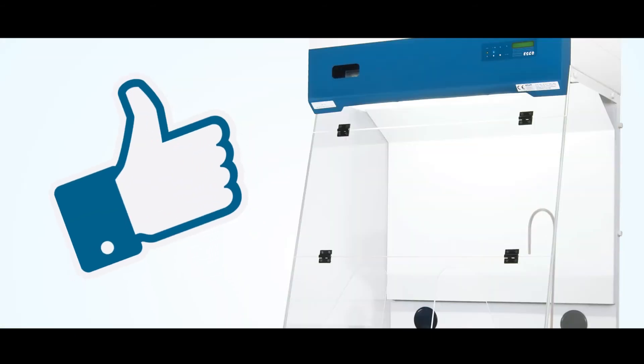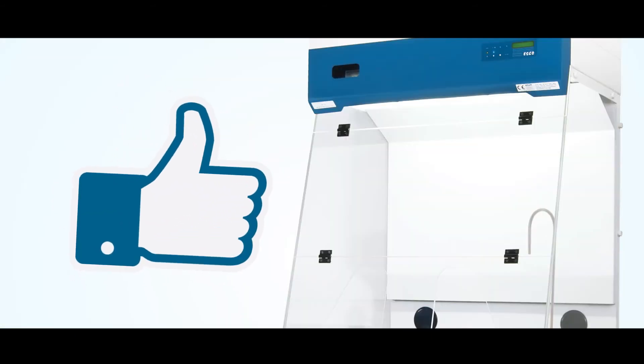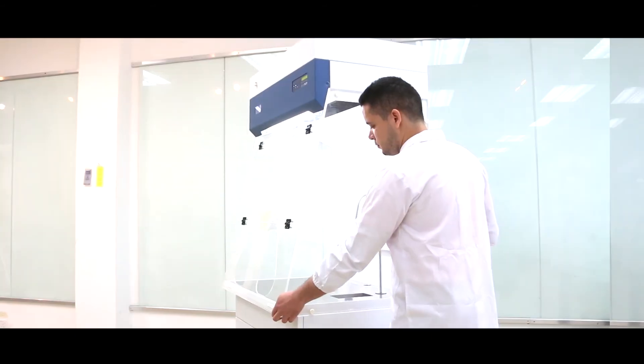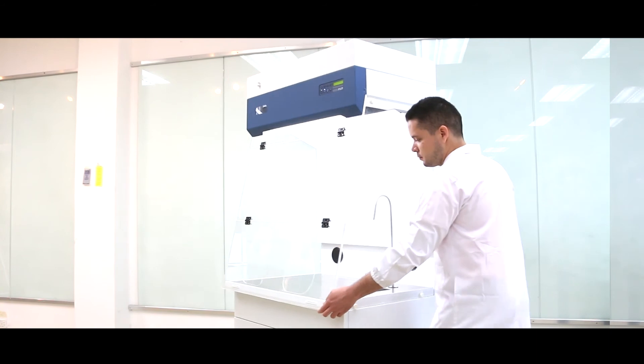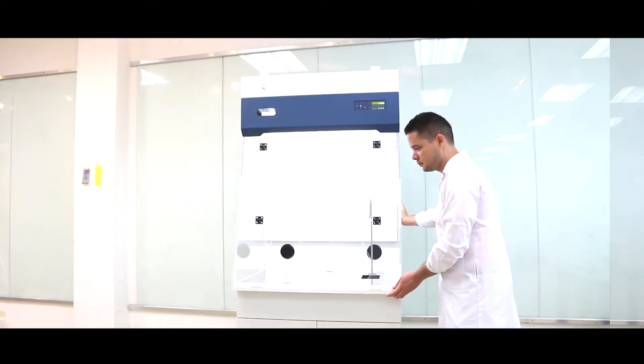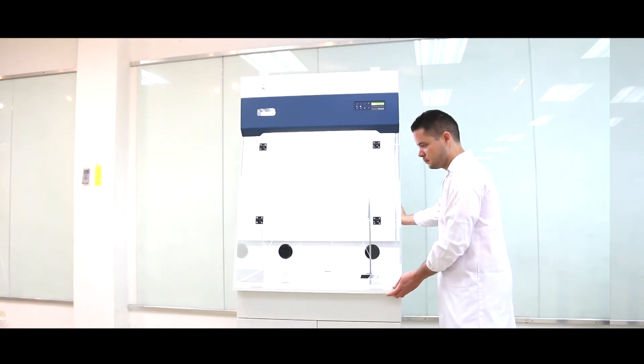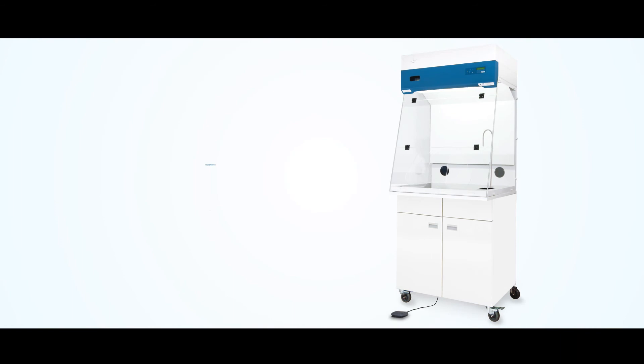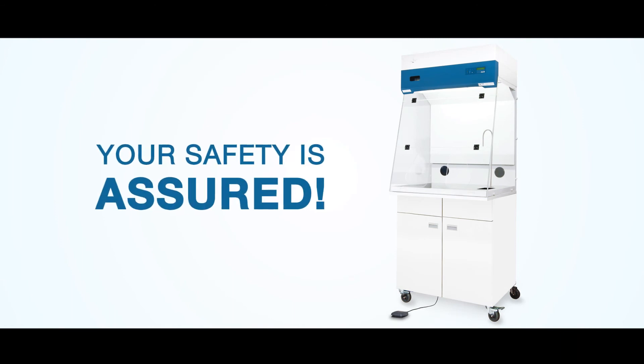Having a Formax is super convenient. It is mobile and can be readily installed in the lab without the need for an elaborate and expensive ducting works. With Formax, your safety is assured.